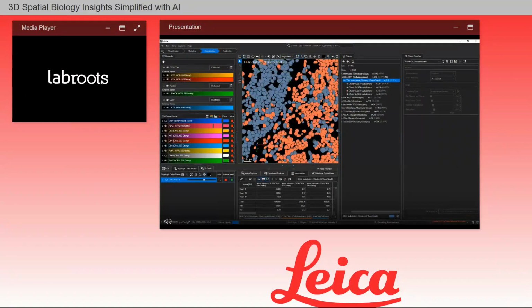We will go to the Objects tab again, and let's spotlight the CD4 positive subclusters. As you can see on the image, I now have 4 classes visible in the CD3, CD4 subset. Now that we have classified our cells based on their biomarker expressions, let's move on to data exploration.